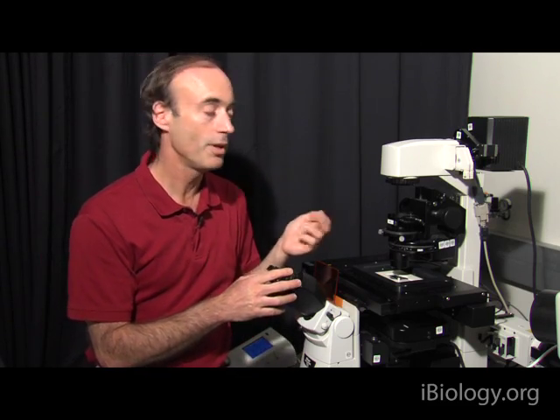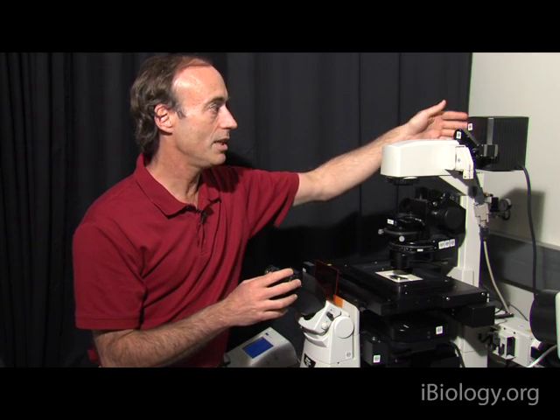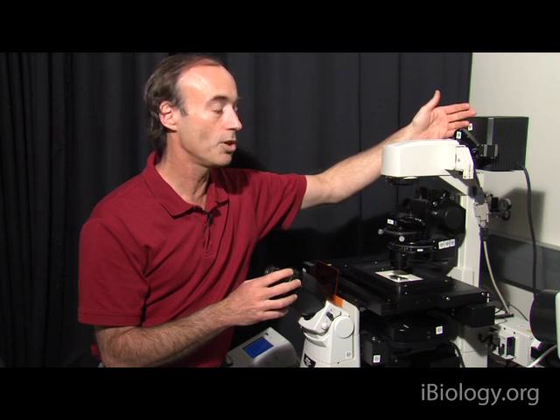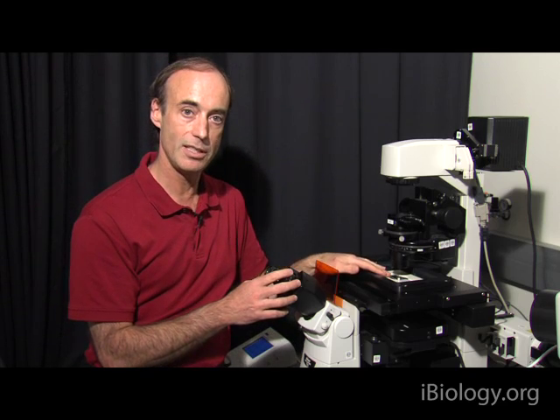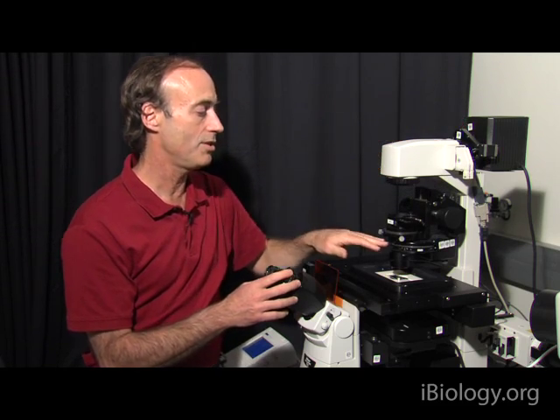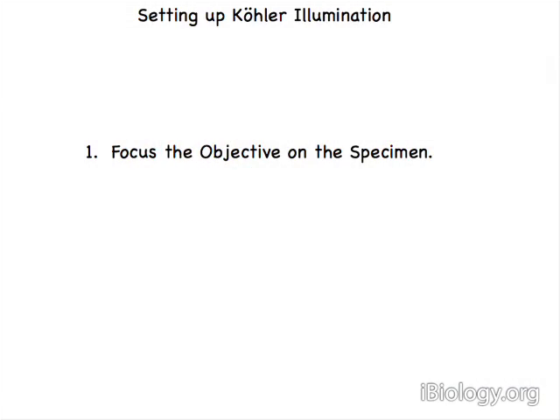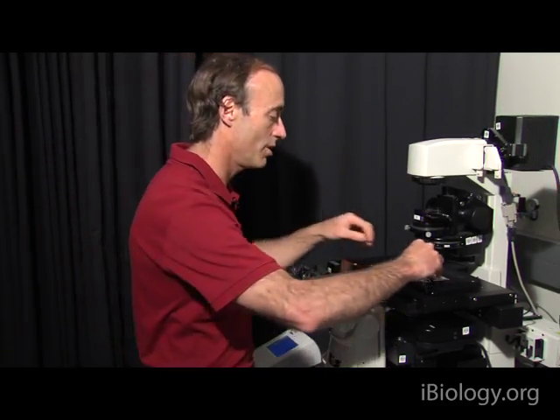In this particular microscope, the light source and lens are perfectly positioned so that when we have the field diaphragm in proper focus at the specimen plane, the light source is also correctly imaged onto the front focal plane of the condenser. Now let's go through this step by step. I'm going to be imaging this sample of a stained section of mammalian taste buds with a 20x objective lens. I'll put the specimen on and make sure the cover slip is facing the right direction towards the objective lens.